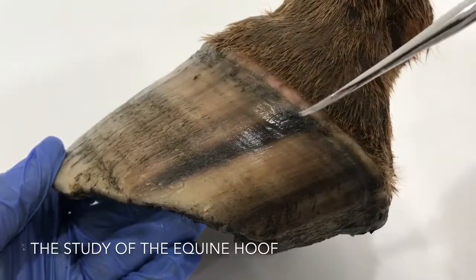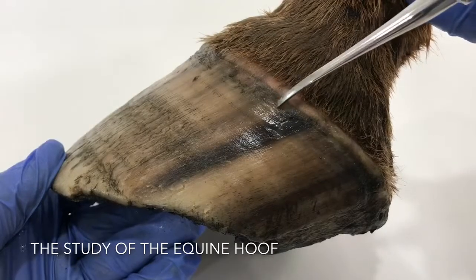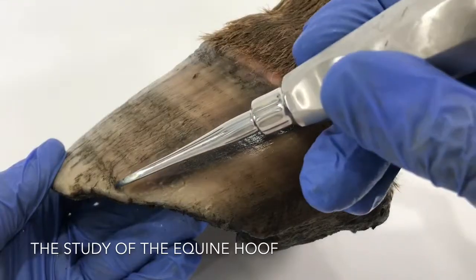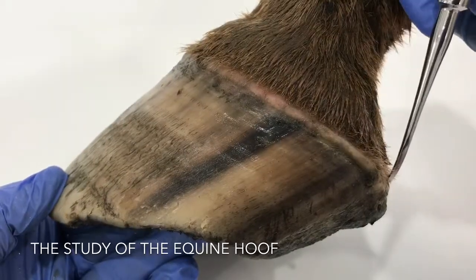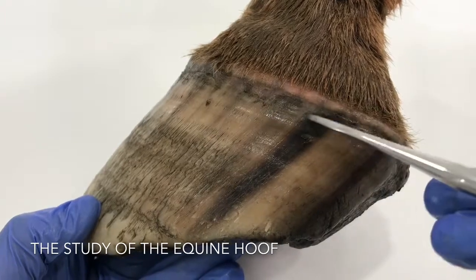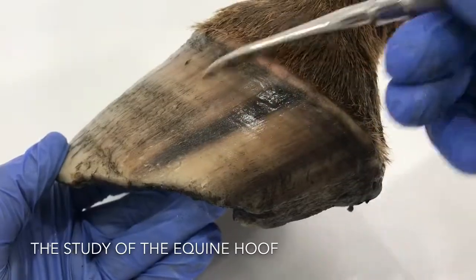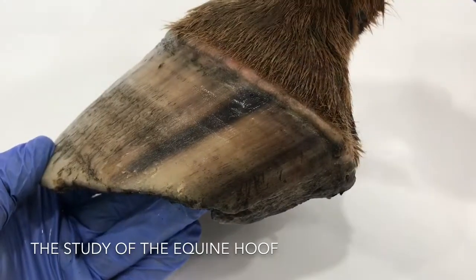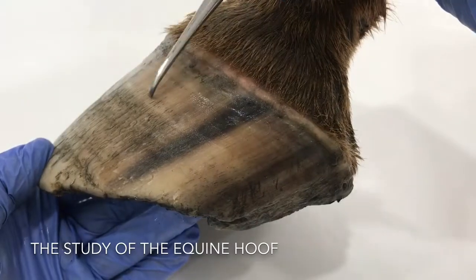Now looking at the tubules. The tubules are those little structures that run from the coronary band in the coronary groove and run down to reach the ground at the bottom of the foot, where they're worn away. This is the area where the tubules are produced — those little lines that you see running down the foot. The tubules are looking quite aligned from top to bottom, and I can't see any ripples. But have a look at the actual growth rings — you can just see a few coming through here which are a little more prominent.